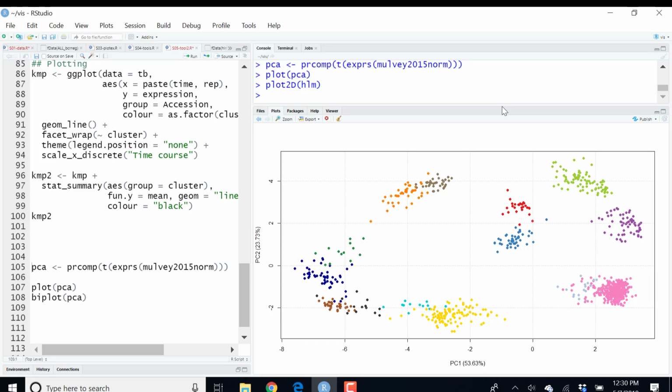And so, because these are completely different scientific questions, here I might want to do what we did before with the hierarchical clustering and see to what extent does the structure of my data correspond to my experimental design. So I want to do a grouping, clustering PCA of my samples.